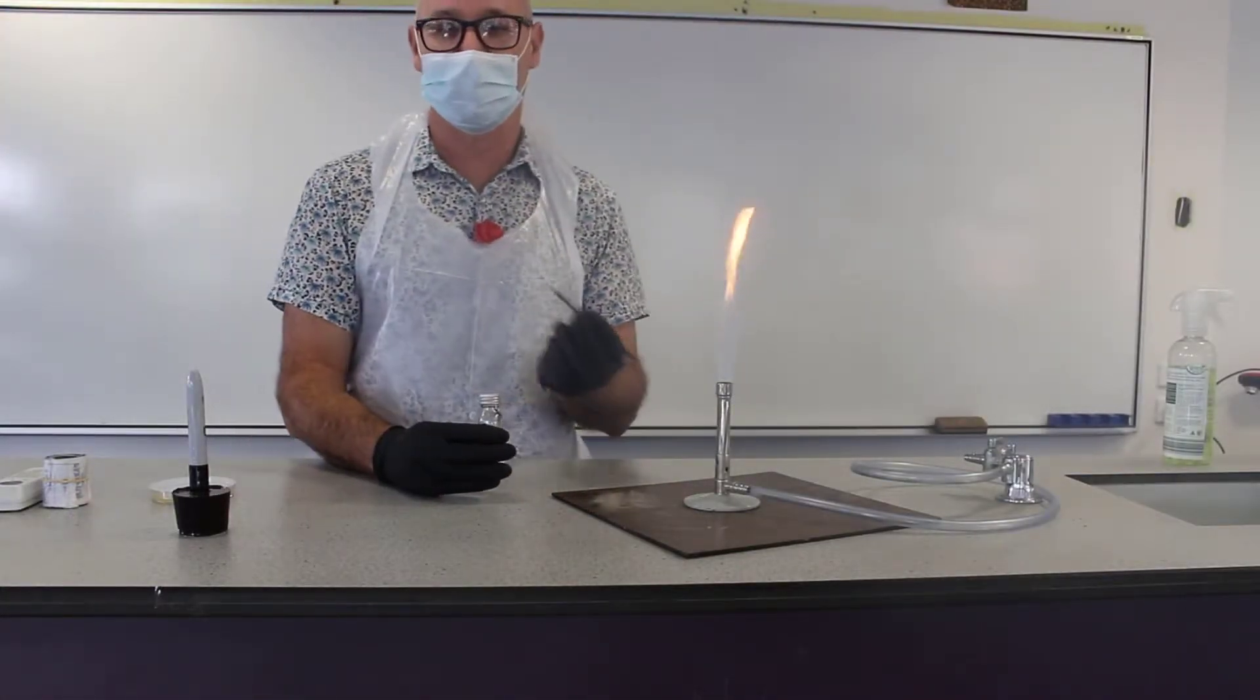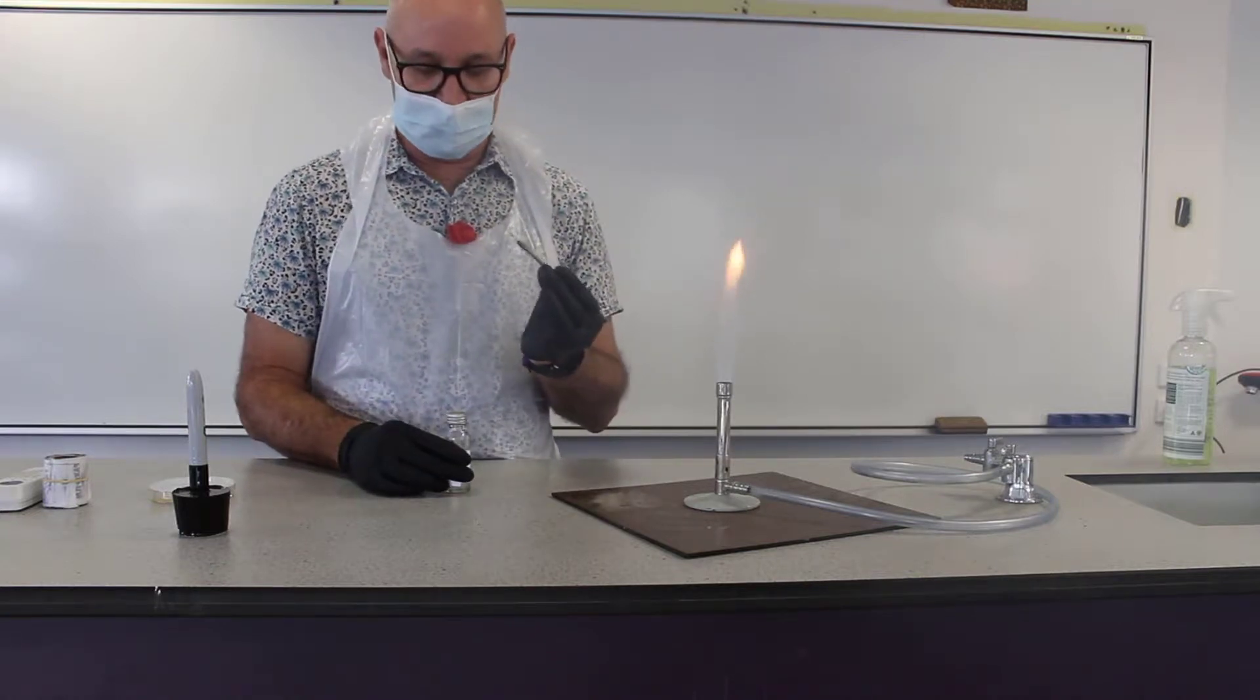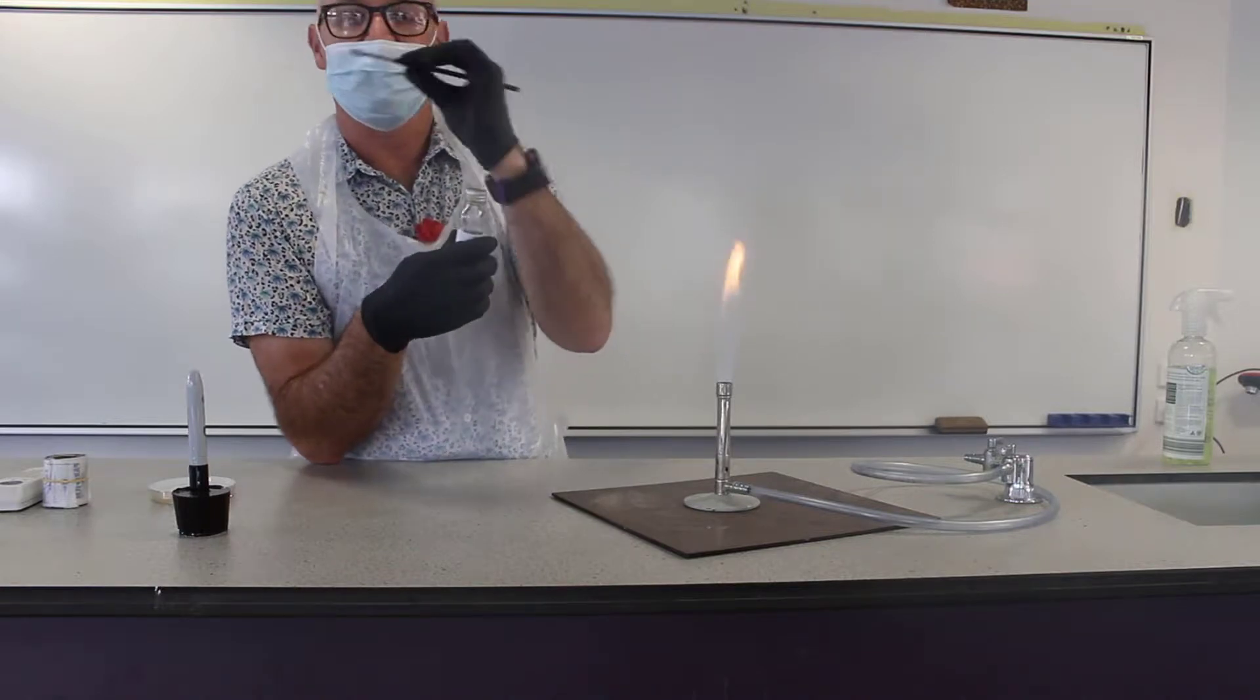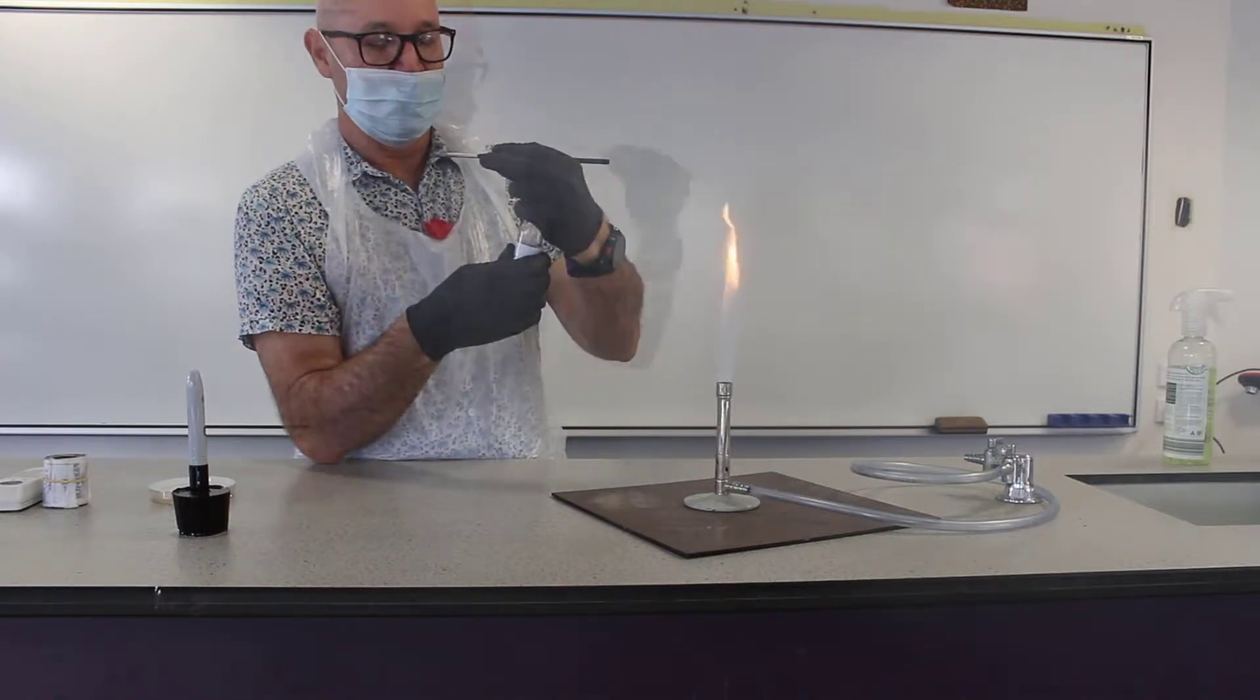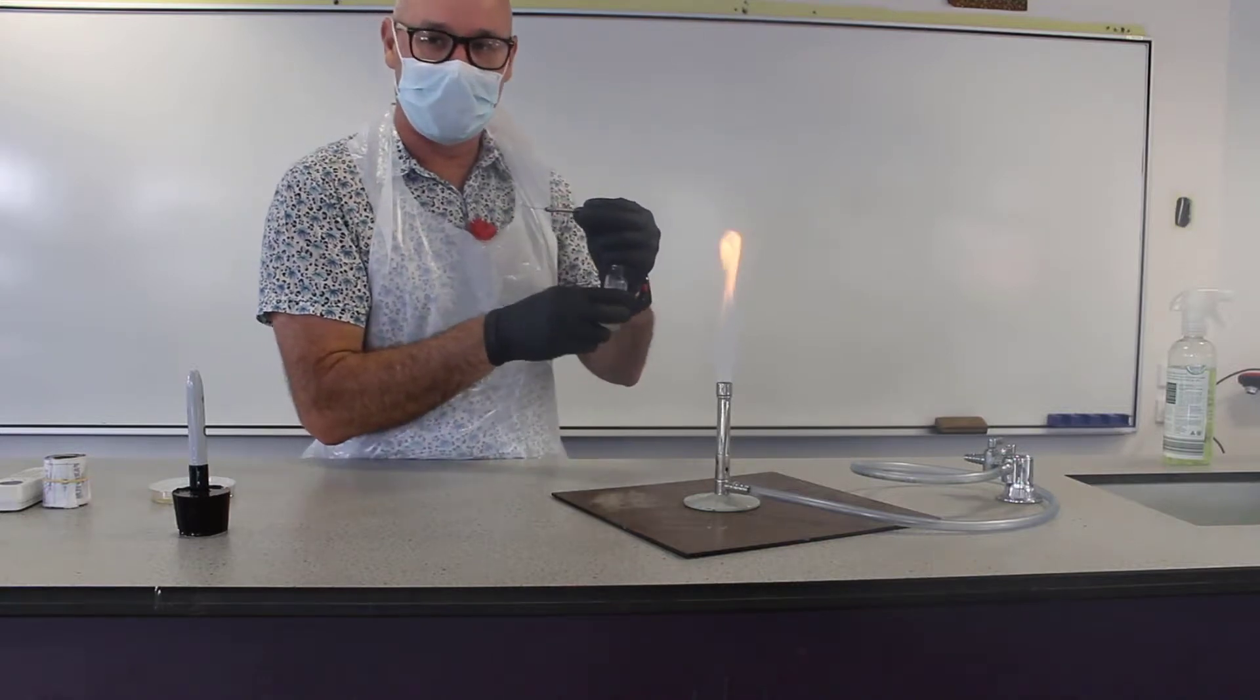But we're not going to put it down anywhere, I'm going to hold it just in my fingers here. When we open up our jar, I'm going to hold it just in my little pinky and then we're going to also pass the neck of the jar through the flame as well.